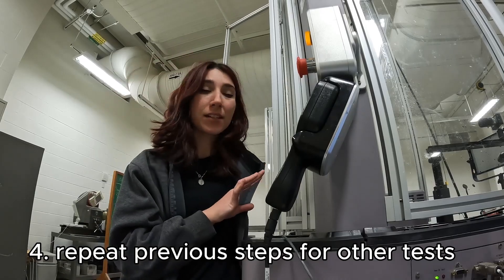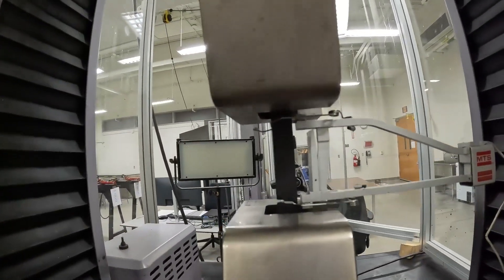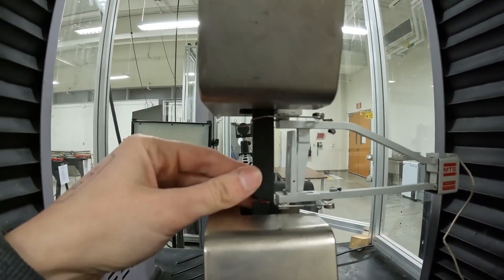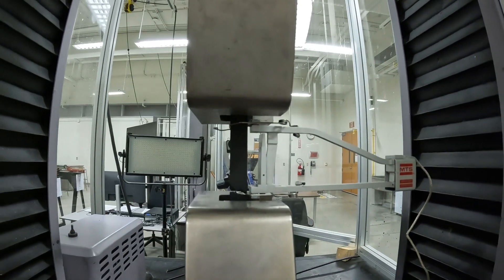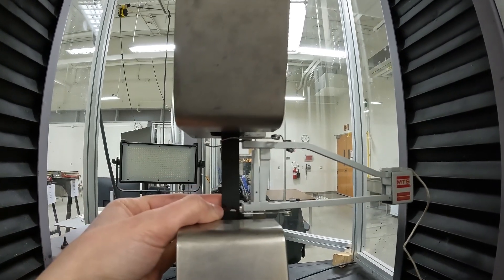In here we have test 62. I've been having this occurrence today where a lot of the samples break where the extensometer spring is. I've had two cases today where it just flew off the sample because of where it cracked.